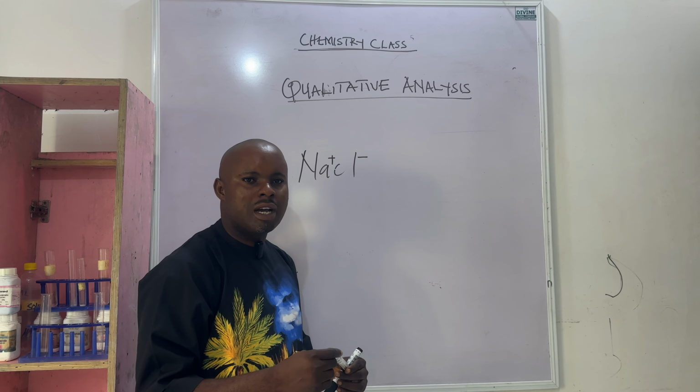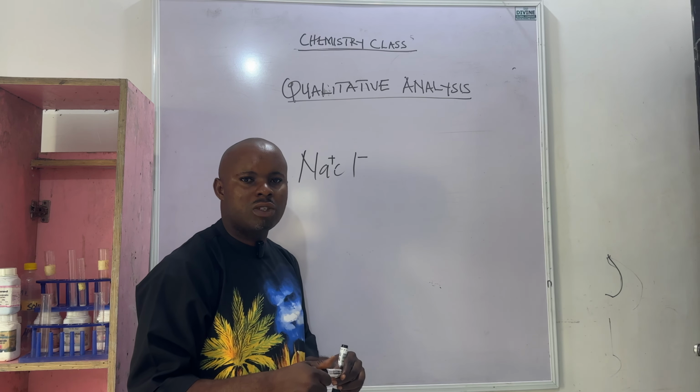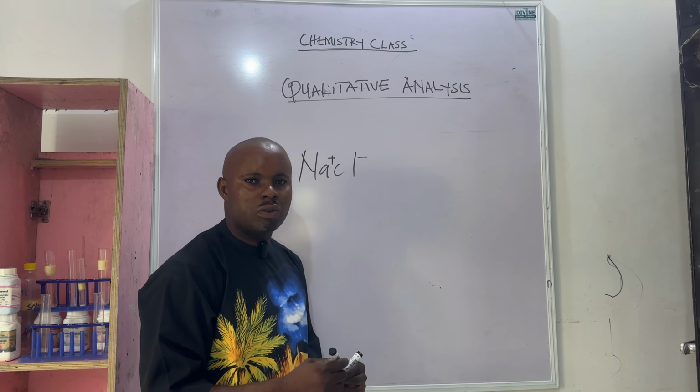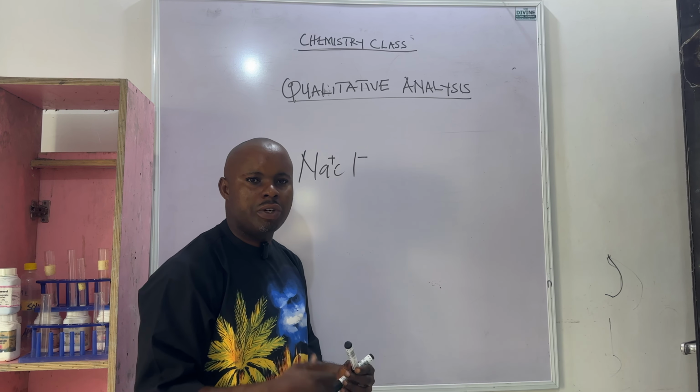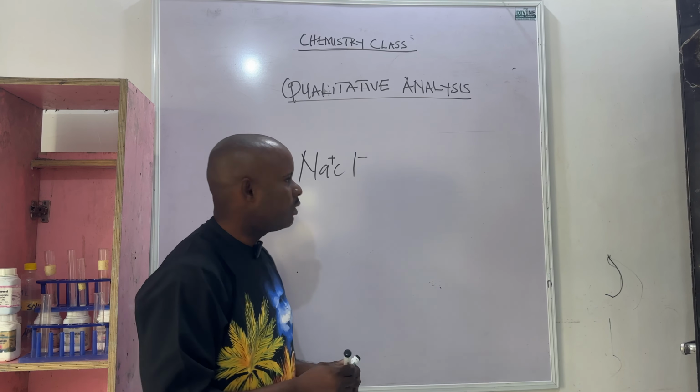In this aspect, I'm going to put you through how to identify this salt and how to analyze each of the salts. And this course will cover a lot of aspects of SSC chemistry, undergraduate courses, and so on and so forth.